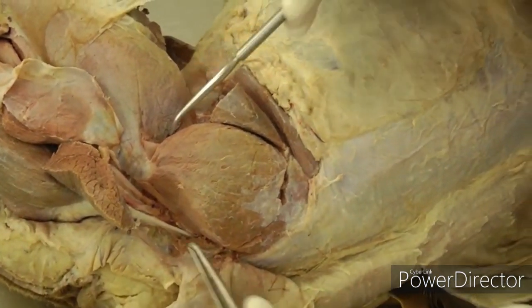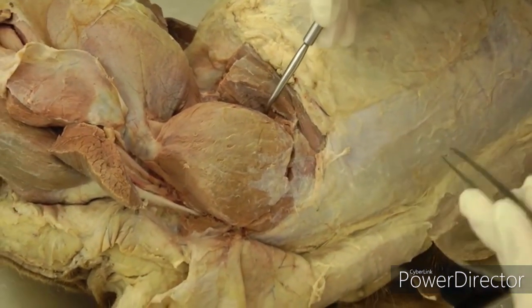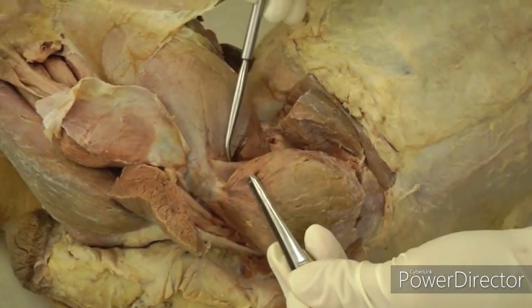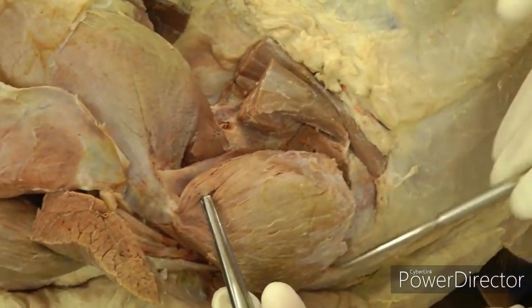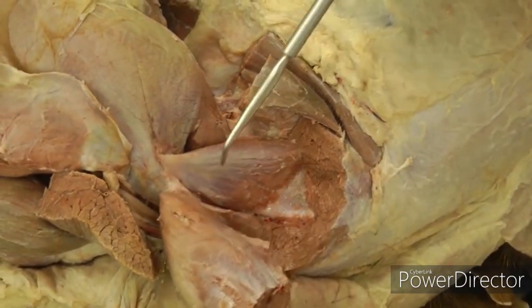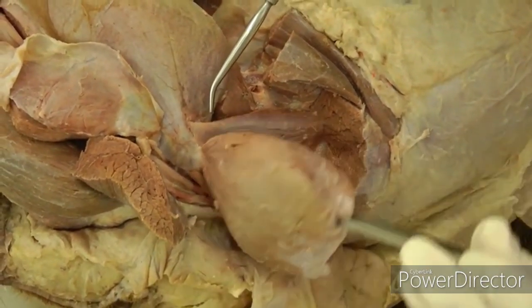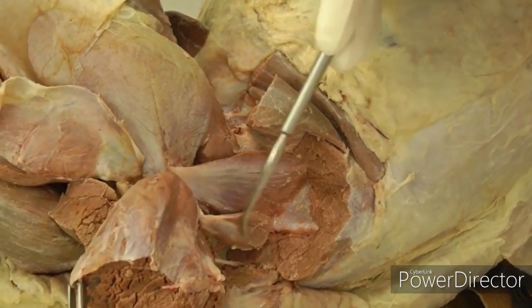Next is the middle gluteal — the biggest part here, very large and fleshy. Transect it but be very careful not to cut all the way through the deep gluteal underneath. Go on the cranial aspect where you can usually see the tendon of the deep gluteal; use a probe to get between the two and then cut across the middle and lift it up. Middle gluteal has an extra small part called the piriformis — as you reflect it, you may be able to separate that out.